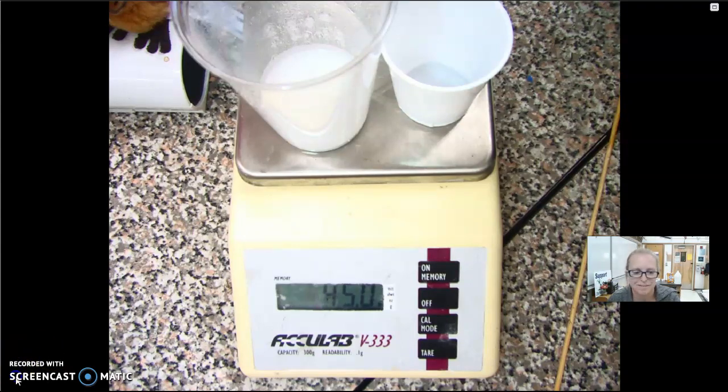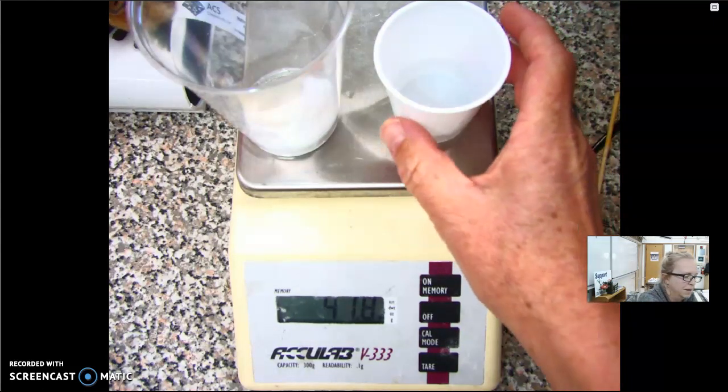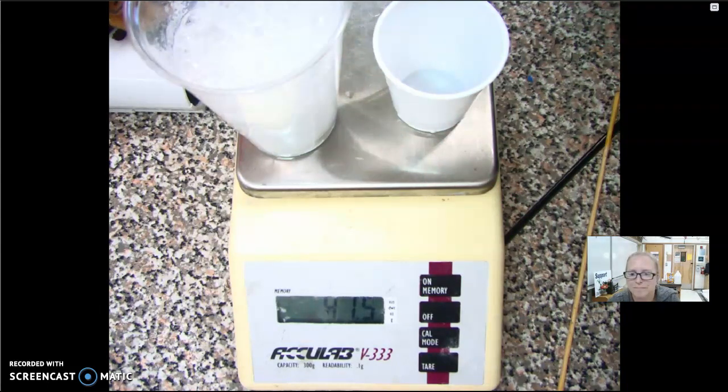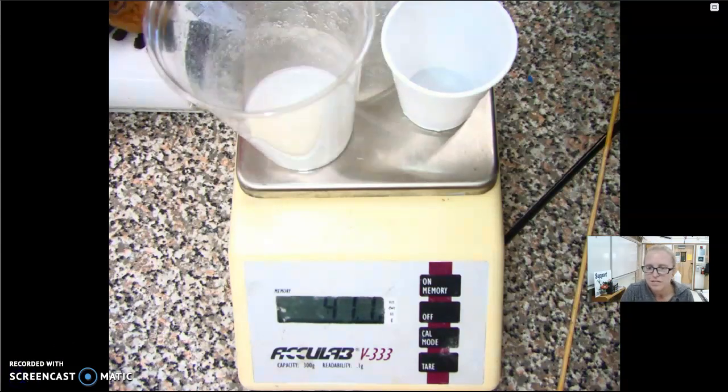So I'll be back. All right, third trial, initial mass, 41.8 grams. Jot that down for part 1. And here we go, we're going to combine it. This is the best part. Okay, we're going to let that go for another minute. I'll be back. All right, so our final mass is 41.1 grams. Okay, so now we've done all 3 trials.